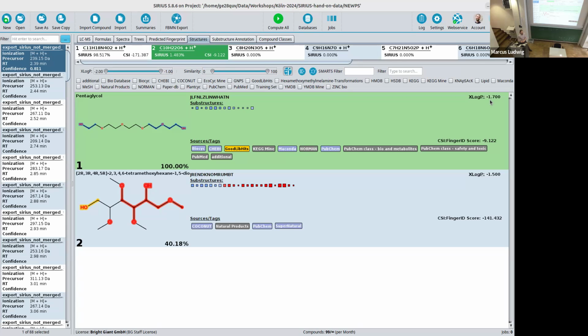Zodiac subtool: is it more or less effective doing it in groups that have been identified by GNPS versus just doing it on the whole data set? In principle, just do it on the whole data set. It's also building a graph in the background to optimize, and this has many more connections than a human being would look at.